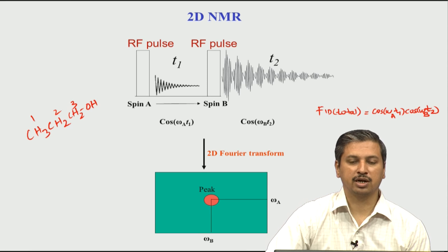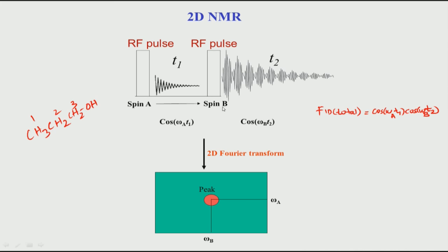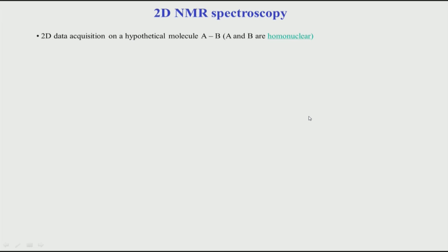This is how we understand how the efficiency matters, and this is a very important concept, because one of the main areas of research in NMR is to maximize this transfer efficiency, because the sensitivity depends very much on how much you get transferred to B. For example, if I keep 99% on A and I can transfer only 1% to B, my system is very weak in intensity. My B spin energy, when I finally get this FID, will not be very good in signal to noise. So, optimizing and maximizing this transfer is an important area of research.